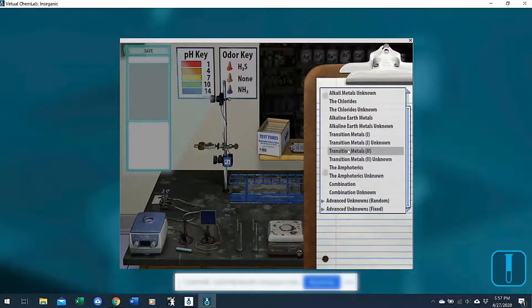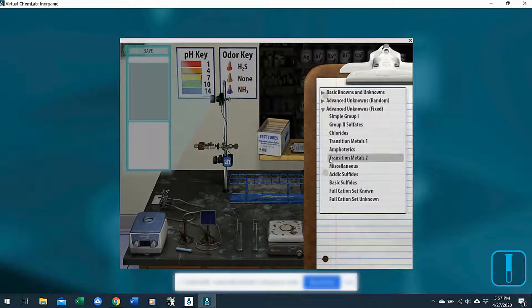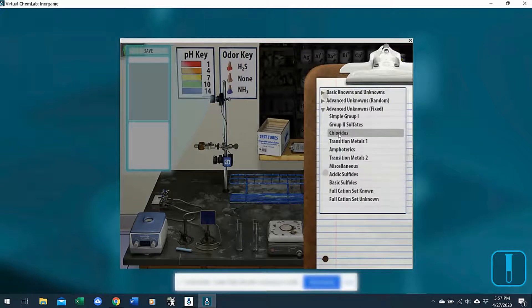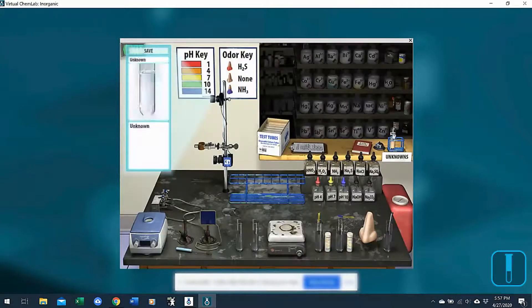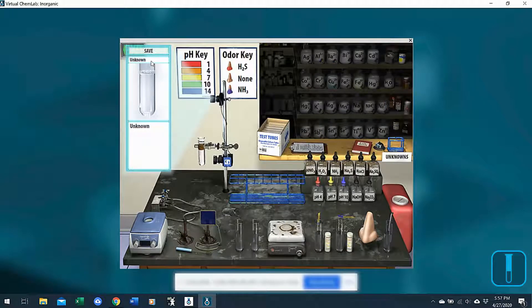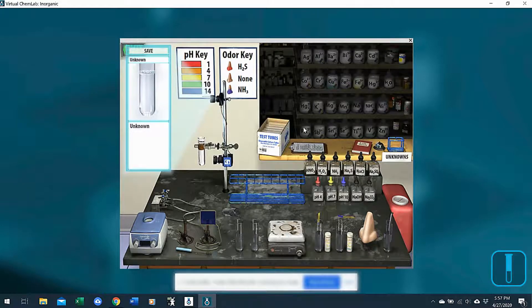Another way to do these is advanced unknowns fixed. With these, a student would choose one of the groups and an unknown tube is created for them. This does not have a number on it, but you can look it up in your answer key. It's under advanced unknowns fixed, and this tube has a specific set of cations in it that you could find in that answer key.